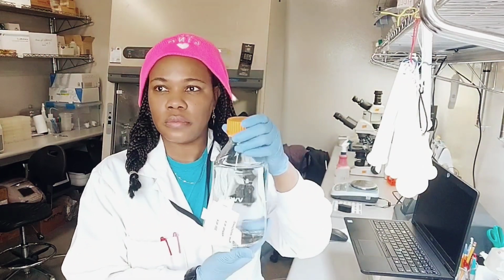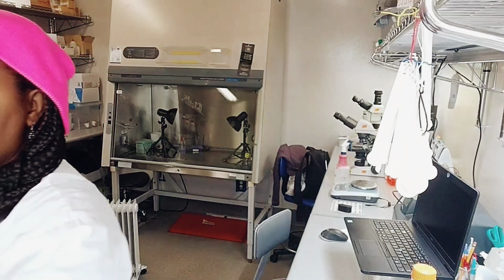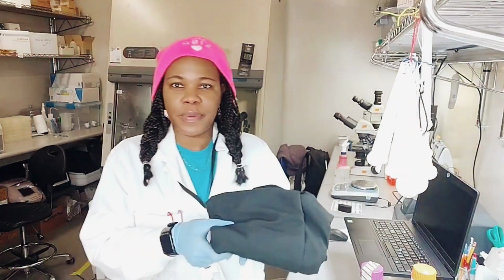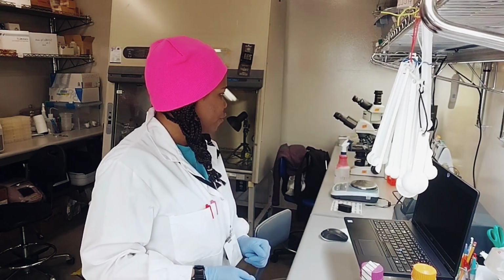I'm going to use about 1000 ml of water, and I might need an empty bottle, not sure yet, seeing that I have the Erlenmeyer flask, but I'm just going to grab one just in case. Empty bottle, and I already have the 1000 microliter, or 1 ml, micropipettes, so that is fine. What am I missing? Oh, I'm going to use a piece of black cloth, because I like taking photos of what the plates look like at the time of making up the inoculum. And yeah, I think that's it for right now, and we'll just go inside and work.